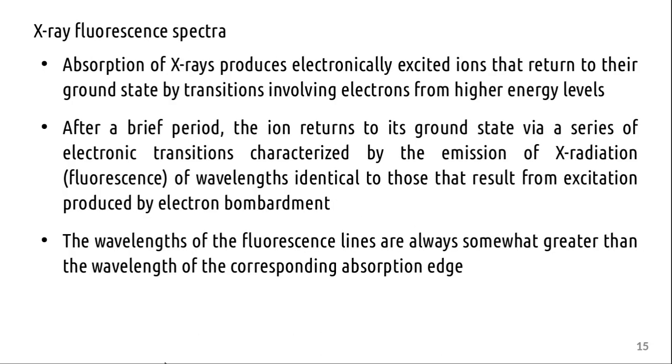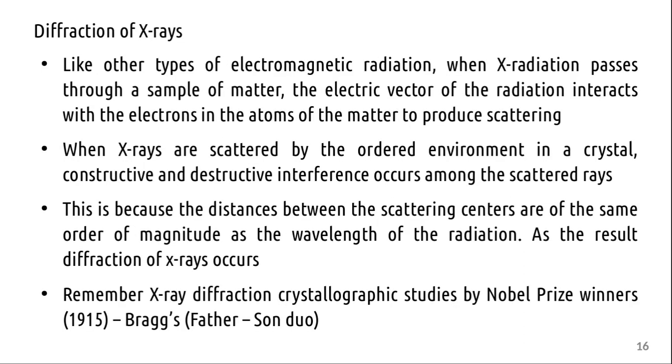There is also fluorescence. Fluorescence is caused by de-excitation of, say, the ion to its ground state with the resultant emission of X-rays. Fluorescence is also a very characteristic property of elements, and this finds use in X-ray fluorescence spectroscopy.